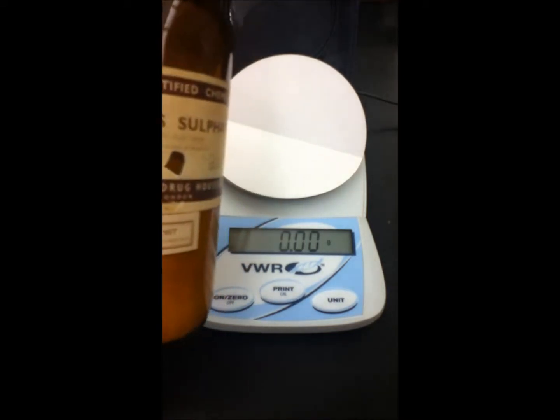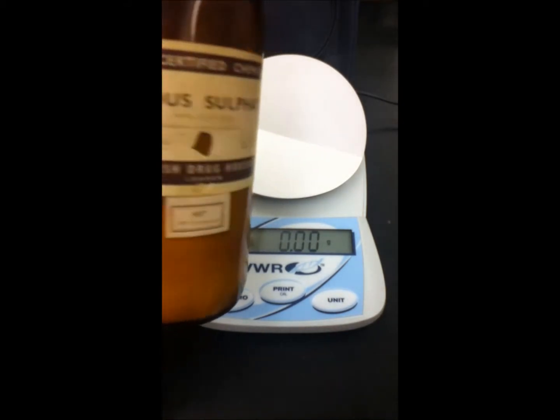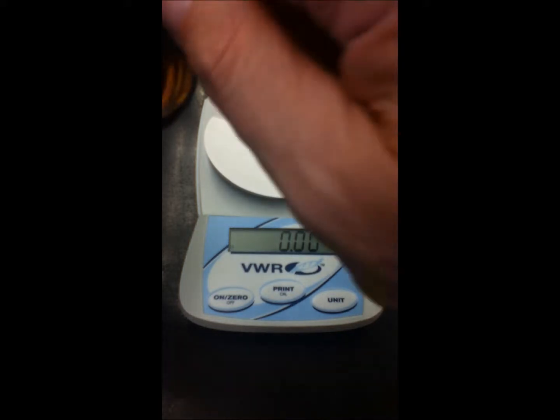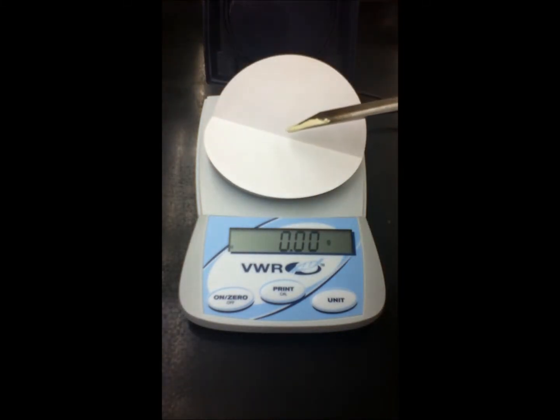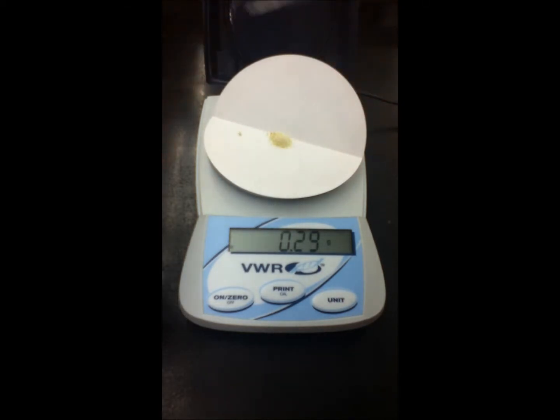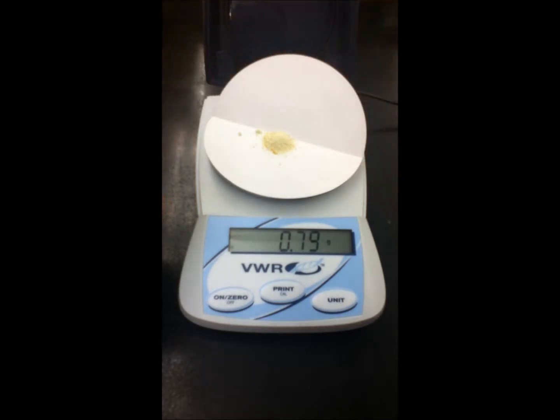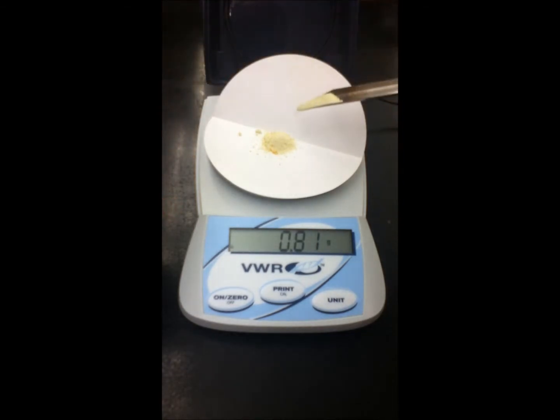We've got some iron sulfate called ferrous sulfate. It's basically a solution of iron and sulfate, and the iron has a charge of positive two. We're going to add this to our filter paper and get it to one gram. We're at 1.01 — not a big deal, we need to be around one gram.